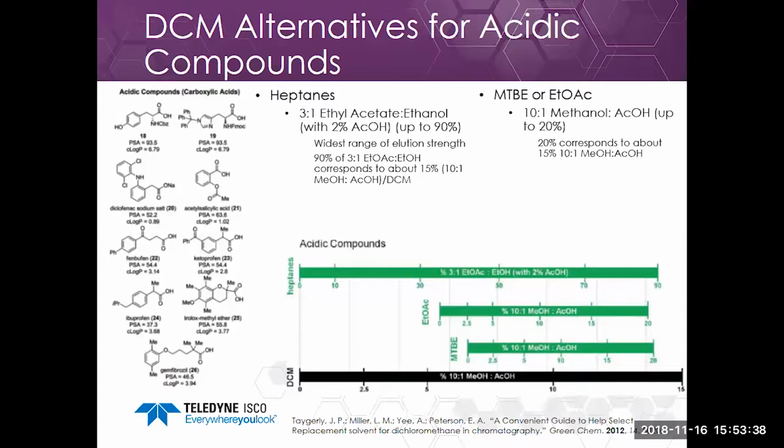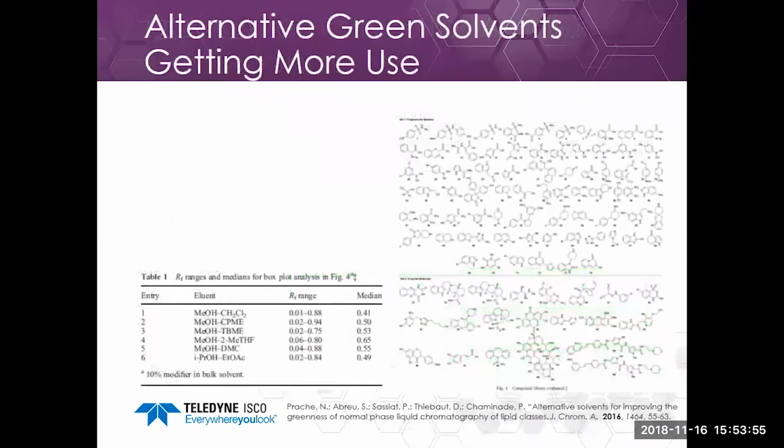So basically, the guide gives you some alternatives. It gives you a starting point. If you know what your DCM conditions are, it gives you a starting point for some consideration of different solvent conditions using the non-DCM mixture.